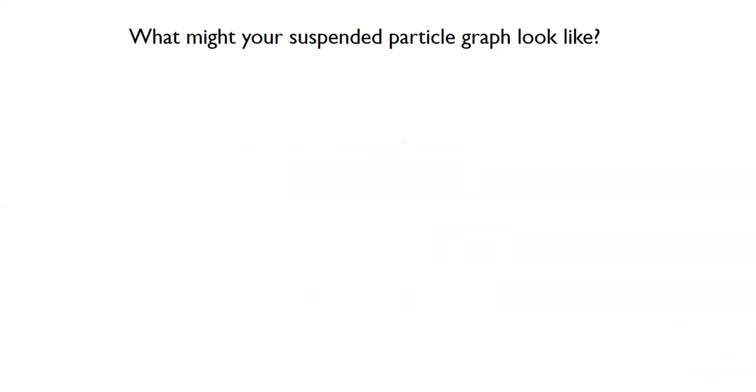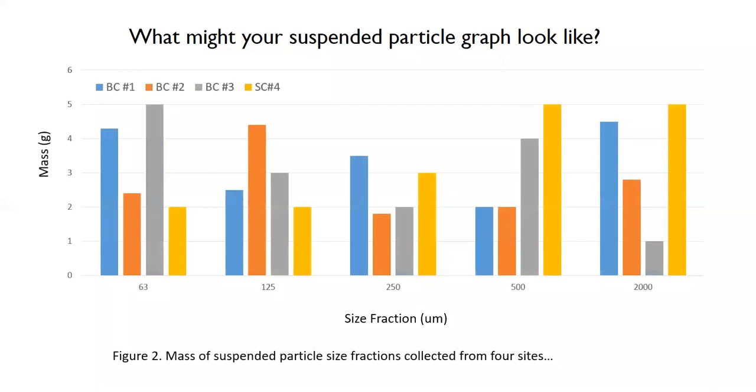Chlorophyll. Now, I asked you to create a graph for the suspended particles. And I asked you what that graph might look like, because I asked you to make a graph that will make it easy to compare the different samples for a given particle size. And so I made something like this. These are not real numbers at all. In fact, they're not even close, but I just wanted to show kind of what this would look like.